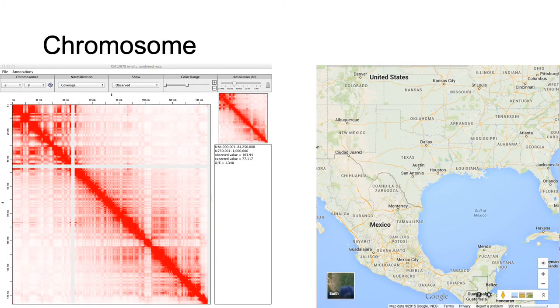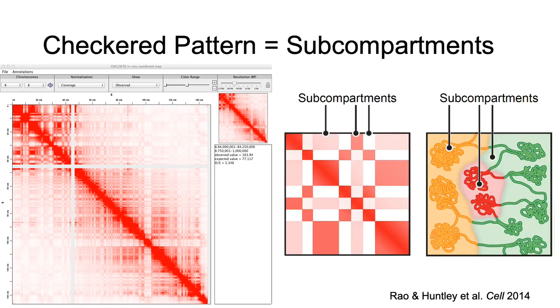Let's zoom in on our chromosome to a country-level view. Now, we see other features emerging, compartments and sub-compartments, decorated by histone marks and determined by their distinct patterns in the contact map.